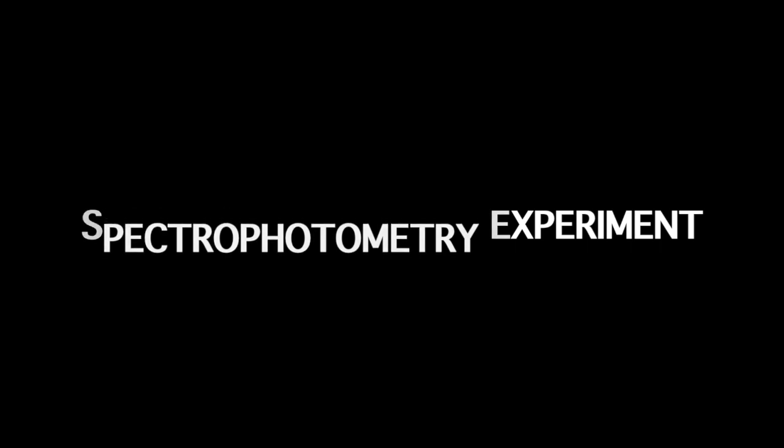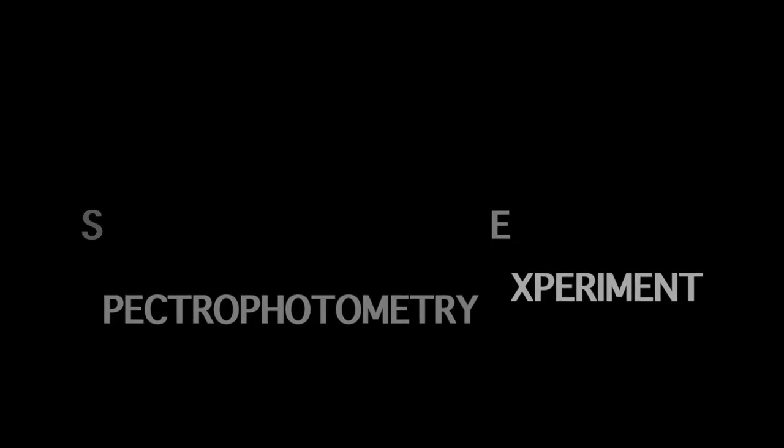Spectrophotometry experiment. In this chapter, you learn how to determine the wavelength at which a colored solution performs maximum absorption, the so-called lambda max.